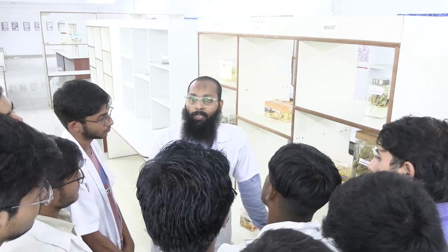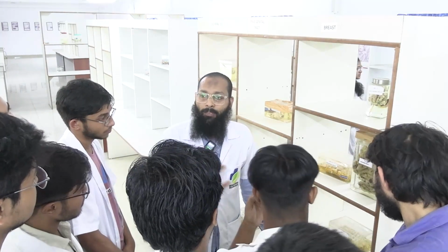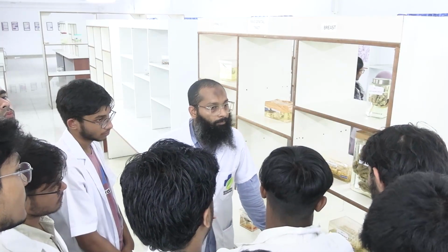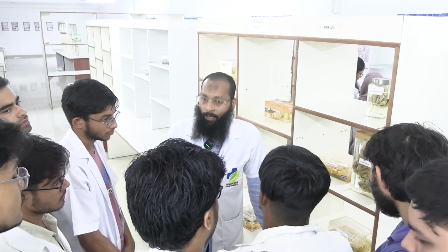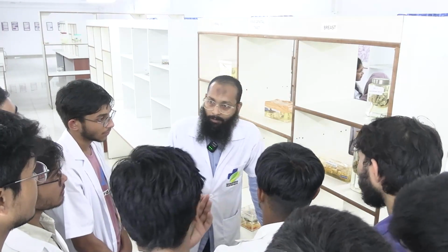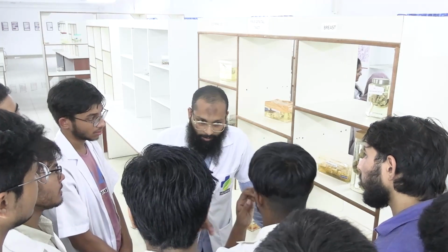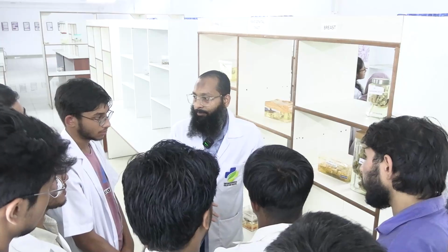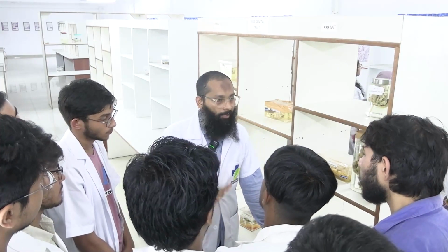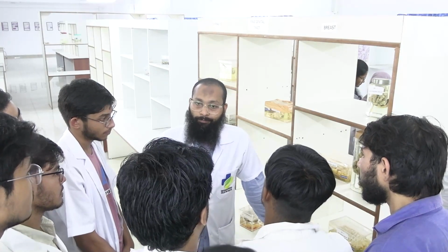Now the presence of a mass doesn't make it a carcinoma breast. What are the other cases in which you can see a mass? What are they? What I just said. What were they? Fibroadenoma, Phyllodes, DCIS, and carcinoma breast. Fine, so in all these 4 cases I can get a mass. But how can I differentiate?